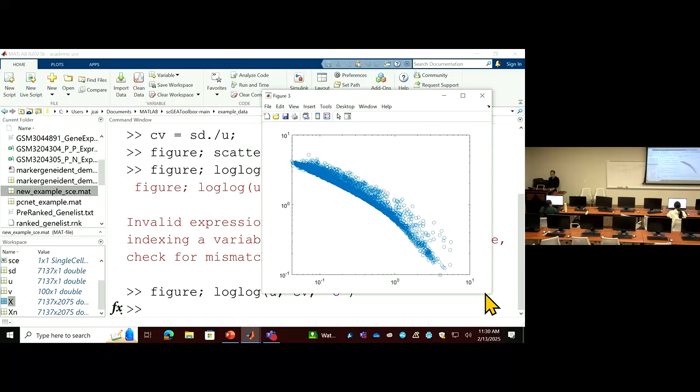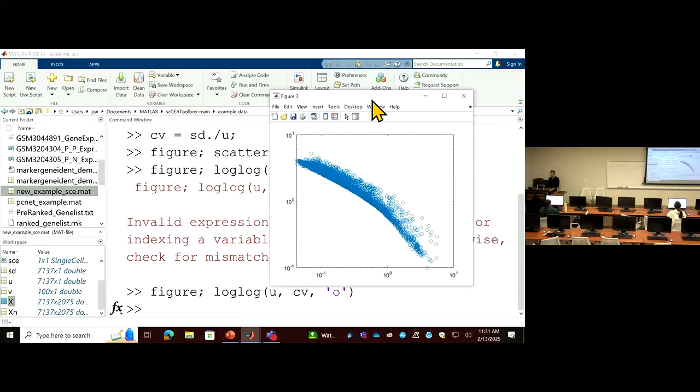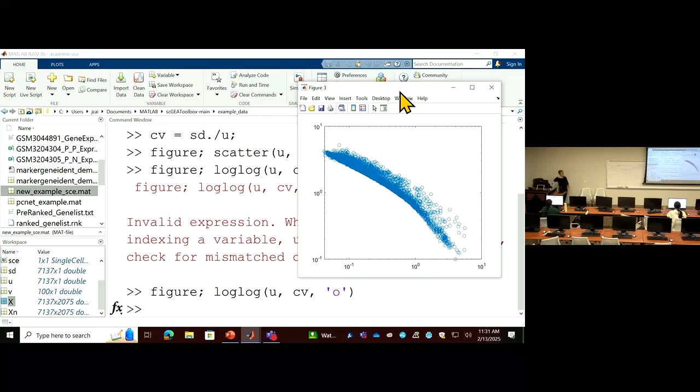Yeah, you see, you transform the curve like that into an almost straight line. Okay, so this is almost. If you look at this, there's some bending down at the end when the expression level is high. The theoretical solution for this problem is a straight line here. We are interested in genes which jump away from this theoretical curve. Those genes are the interesting ones.